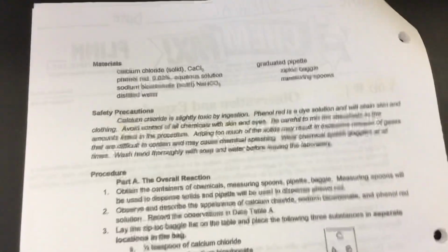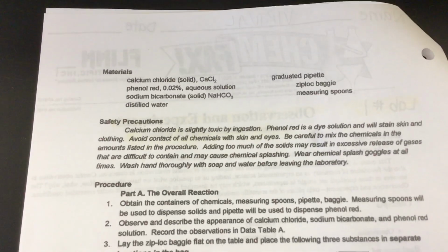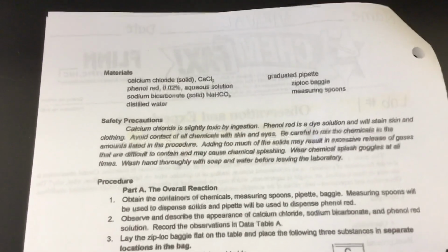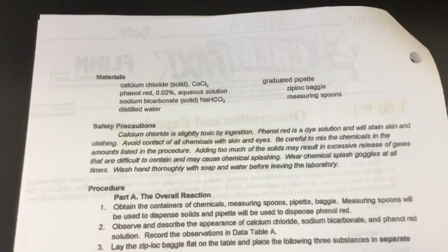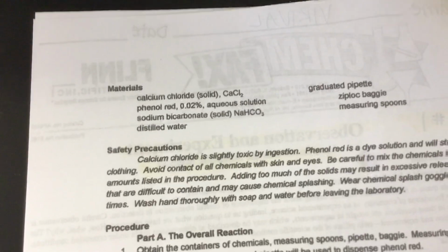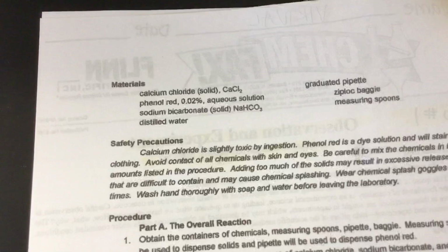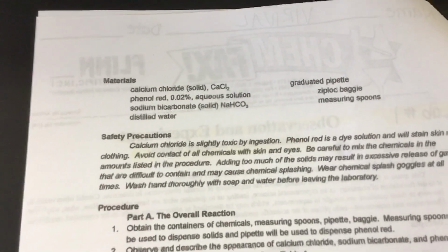All right, so let's look at the materials that we're going to be using today. We are using calcium chloride, phenol red, sodium bicarbonate, which is also known as baking soda, distilled water, graduated pipettes, Ziploc baggies, and measuring spoons. The idea for today is that we are going to be mixing these different chemicals in different ways. Sometimes we'll mix 2 together, sometimes we'll mix 3 together, sometimes we'll mix all 4 together, and we'll see what happens.